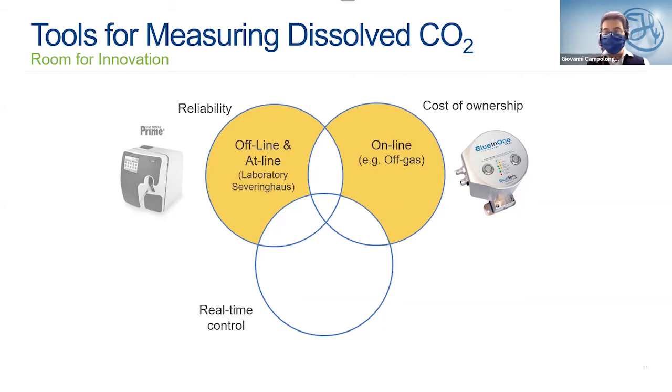Especially if you compare what the dissolved CO2 is at the base of a 20,000 liter bioreactor, it is completely different from what you can have in the headspace. And you can find quite easily, if you just Google it, research that shows that when you increase the agitation speed in your bioreactor, the off-gas and then inline dissolved CO2 will decrease.